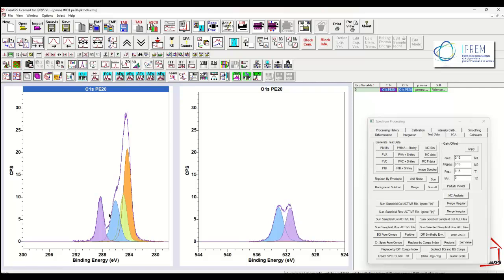Having done so, it's quite clear that there is a similarity in corrected intensity between the oxygen 1s and the carbon 1s. They're color coded here to indicate the different chemical states, and once we look at it in this way, you can see why when we perform quantification we can end up with the correct ratio based on two peak models. The original data would not give you that ratio, but after you've corrected for these relative sensitivity, escape depth and transmission, then you end up with a result that makes more physical sense.